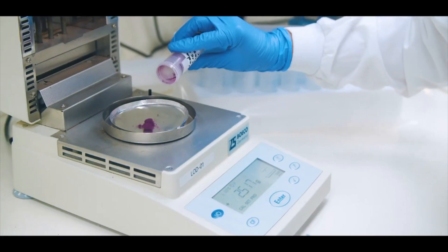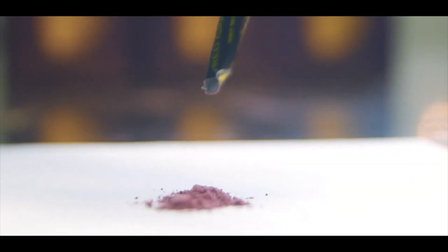The last phase is in the large commercial scale bioreactors. Within three weeks and hence 17 cycles per year, the cells grow to reach the adequate biomass that is then dried into a final powder form containing the desired active ingredients.